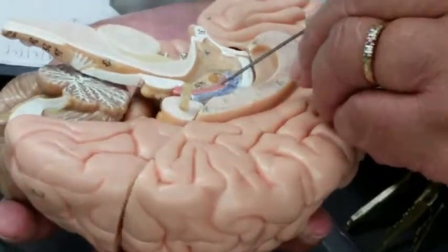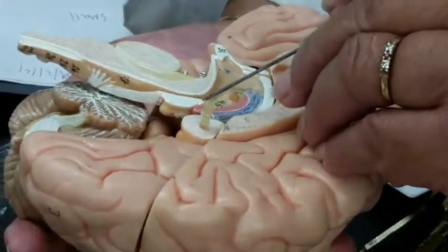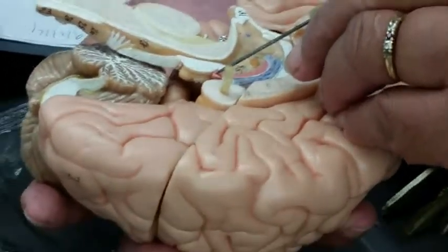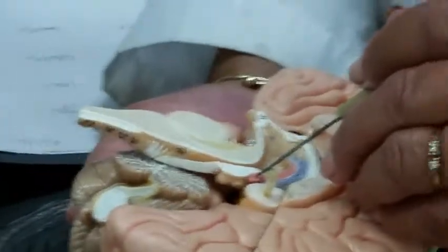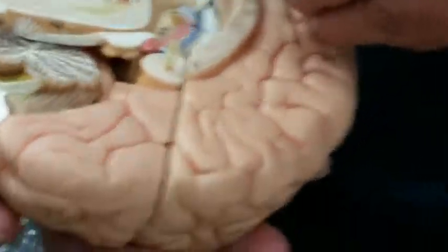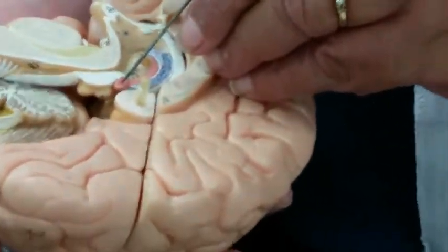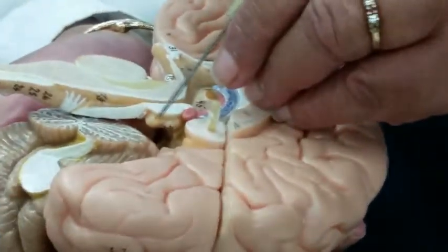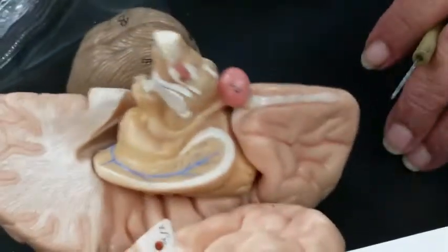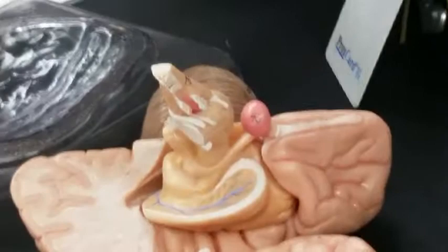And right here, see, this is a choroid plexus. Location, location. Right here, close to the corpora quadrigemina, is the pineal gland, or the pineal body. So here is the choroid plexus, but right there, that's the pineal gland or the pineal body. And you have two mounds here, two on the other side. It's the corpora quadrigemina, beautiful on the sheep brain by itself.